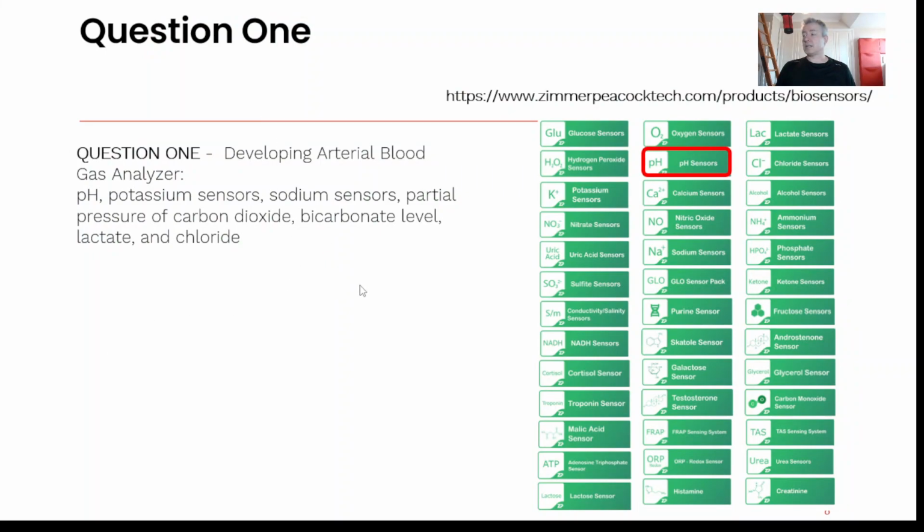So that said, we do have pH. We do have potassium, which is definitely one of the sensors that you are interested in. We definitely have sodium on the website, and I did look around here, and a number of the data sheets are actually on the website. What we do have in the public domain is on there, and if you require anything else, then it's basically a deep, funded collaboration with ZP.